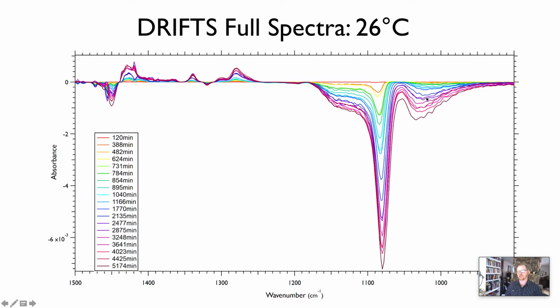You can also see there's another competing peak on there, which is why doing that data deconvolution you did in Spec 2 is really important, right? There are competing peaks in the same region. But now this peak here and here and here, these are all differing peaks. And you can even see there's some really interesting stuff going on in the ammonia region. We could elucidate things about the mechanism, but we didn't for this experiment.